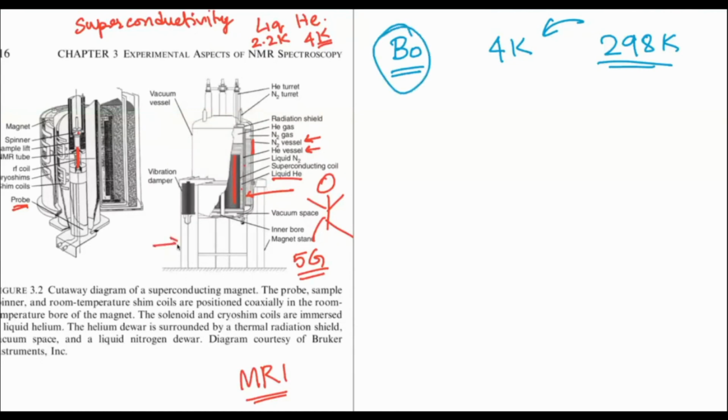The vibration legs that you see around, the huge things that I also marked in the big magnets, are there to ensure that any vibrations that might come from the ground are dampened.